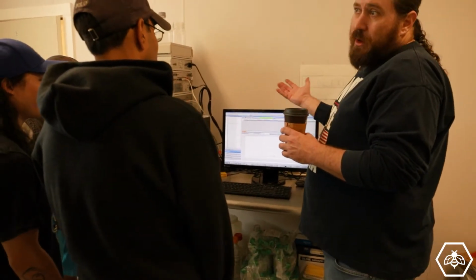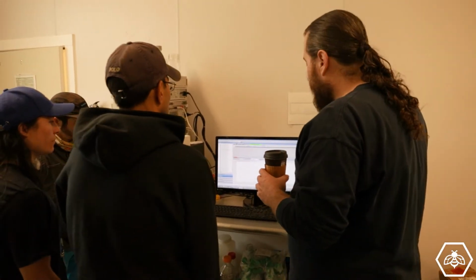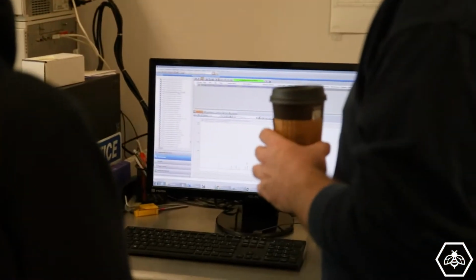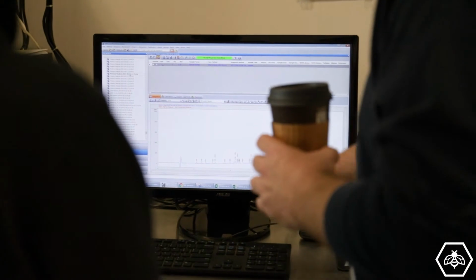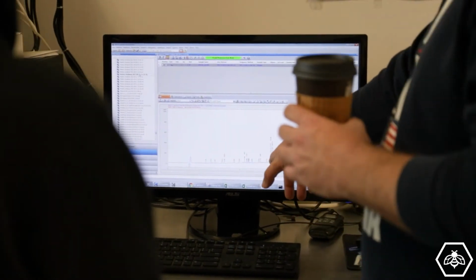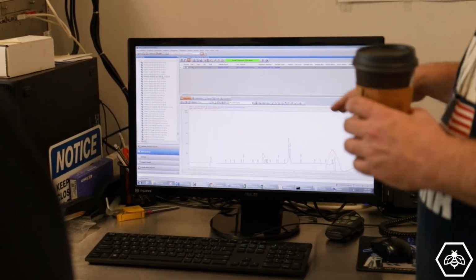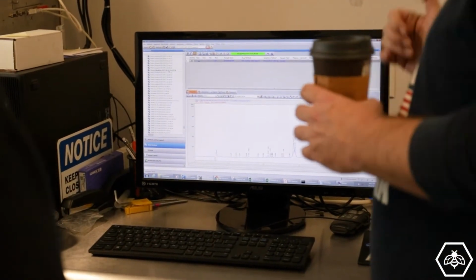Neutralize the acid so the reaction stops. So that's what we're going to do: at 30, 35 minutes, just throw it in there, because it takes 12 minutes to run the whole test, but it takes about 6 minutes to get to this point, plus prepping the sample. So you can miss your window if you're in here prepping the sample. We need to figure out exactly which time it is, which won't be hard at all.